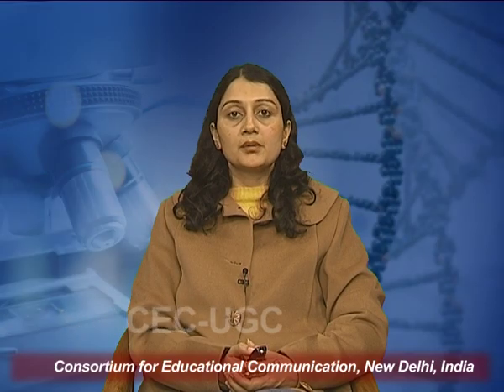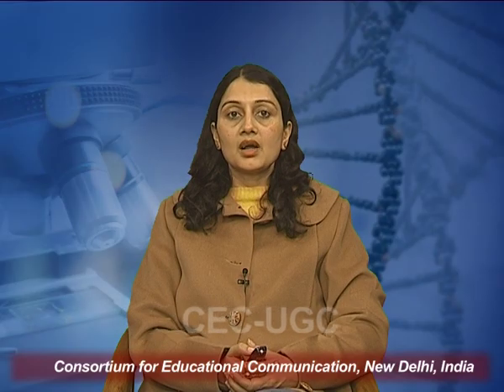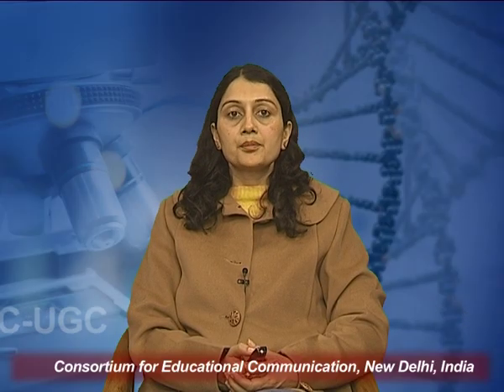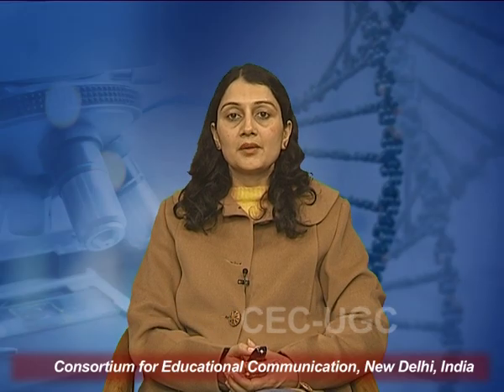The third, minerals. Calcium, chlorine, magnesium, phosphorus, potassium and sulfur are the essential minerals for all media because they are required by all microbes. Other minerals like copper, cobalt, iron, manganese, molybdenum and zinc are trace elements which are needed in minute quantity, and they can be present as impurities in other components. The specific concentration of these elements depends upon the microorganism being cultured.